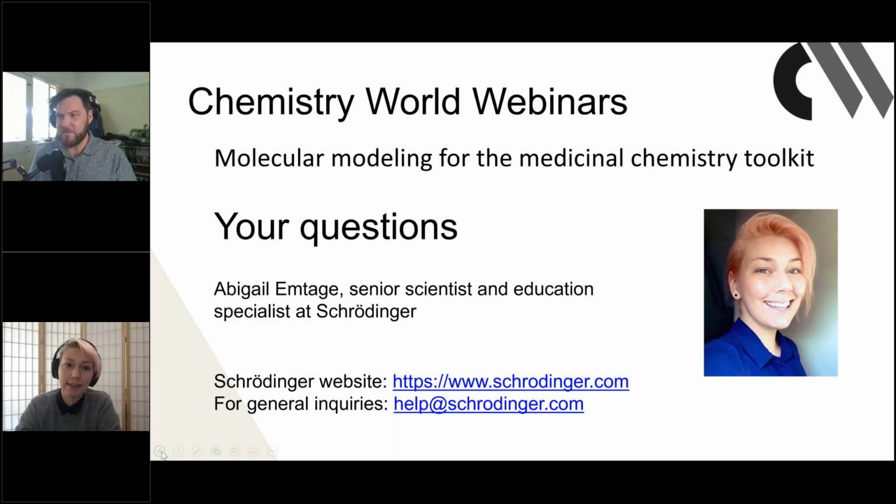Yes, and we had a similar question as well about docking models and so on. Can you design and import your own docking models, or do you have to use what's already there? Yes, you can, and that's one of the really powerful things about LiveDesign. You can import pre-generated docking models that, for example, the computational chemist within your drug discovery team has pre-validated or has been using for the project up until this point.